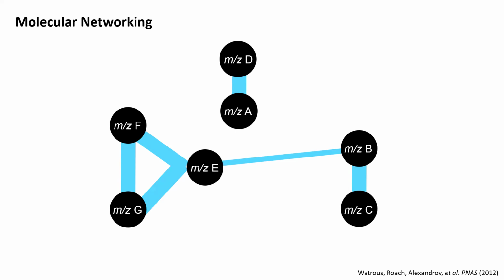So we have these nodes that are similar to each other, and these two that are dissimilar from this one, but are similar with each other. And hopefully, if we are lucky and we get an ID, like in this case, we are going to have information not only on this node, but also on the connected nodes.